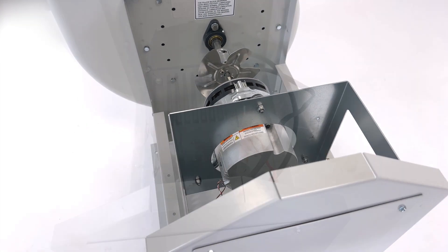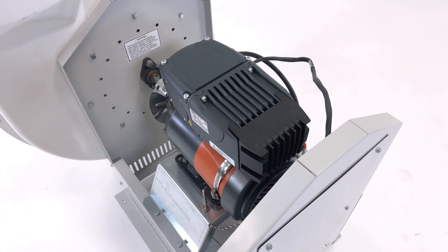One horsepower models feature an electronically commutated motor and the two horsepower model uses a variable frequency drive motor. Both have built-in overload protection to prevent damage from occurring, even in extreme cases.